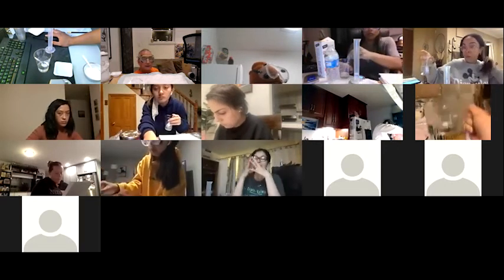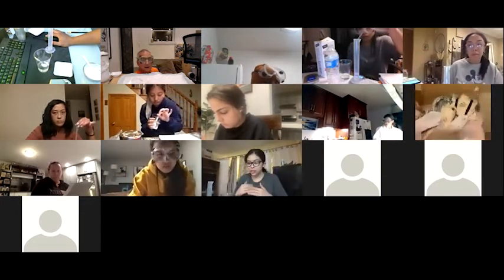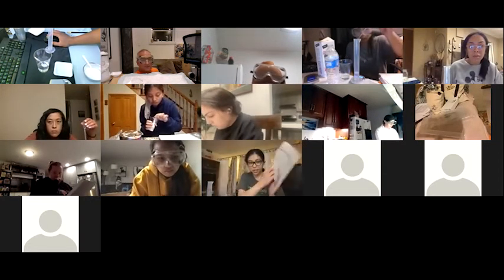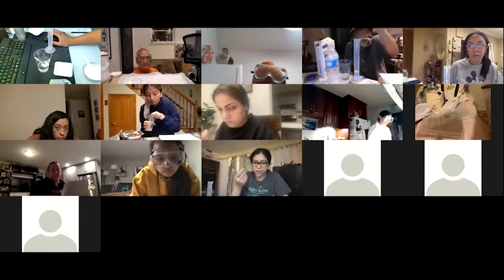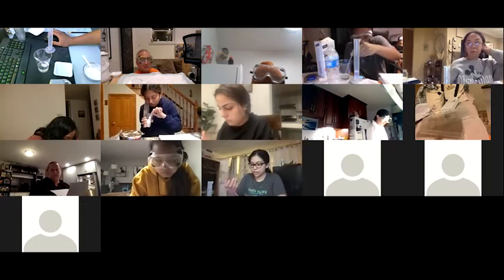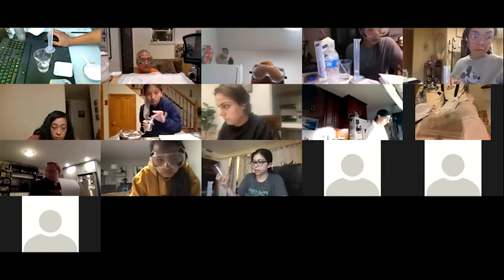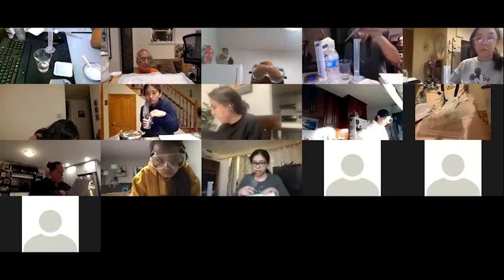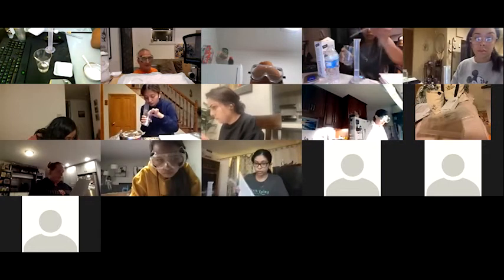Hi, Professor. I'm actually a bit behind because I'm just really slow, but just to clarify, because I was still doing the first part when you were still continuing. Okay, I have my 10% water, right? Not 10% water. It's the cup. So 10%, what's it 10% of though? Oh, I just labeled the cup 10%. Right, but what is the solution? Is 10% of what? It's 10% sucrose, right? Yeah, there you go.